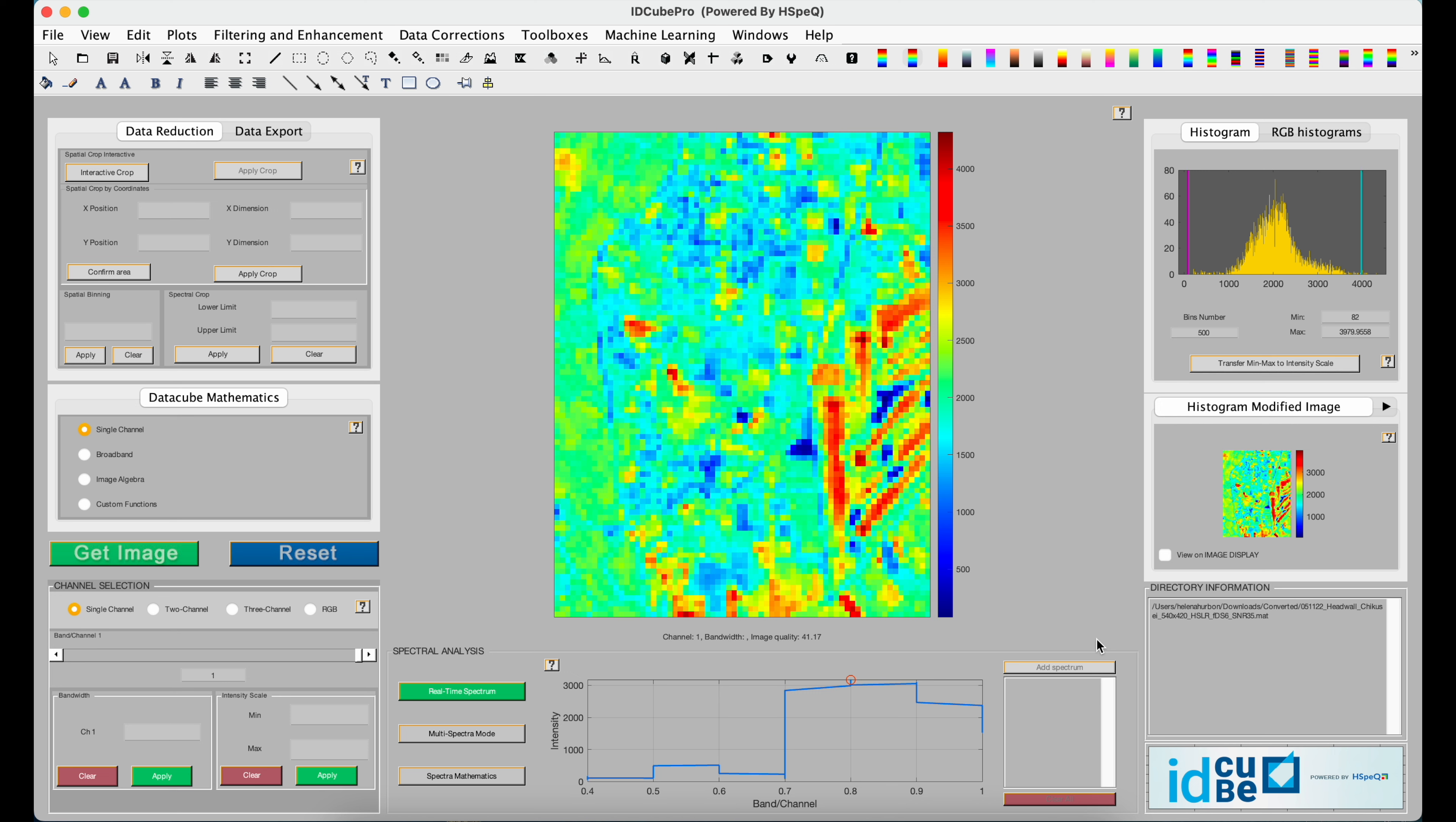Hi, welcome to our IDQ Pro tutorial series. My name is Helena and today I'll be talking about how to use the Fusion Toolbox in IDQ Pro. This toolbox combines low-resolution hyperspectral datasets with high-resolution multispectral datasets to generate a high-resolution hyperspectral dataset. In future releases, we'll also evaluate the quality of the fusion.